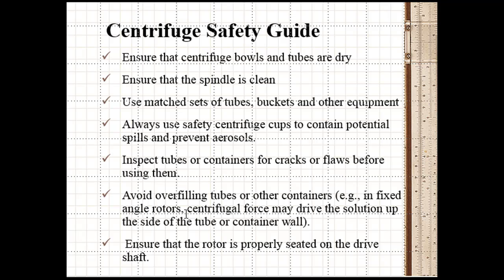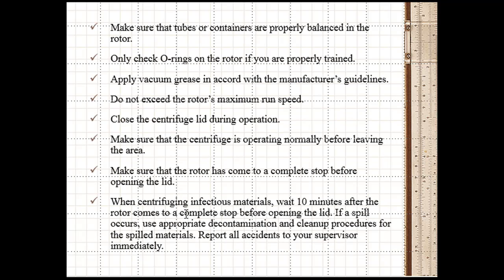For example, in a fixed angle rotor, centrifugal force may drive solution up the side of the tube and container wall. Ensure that the rotor is properly fitted on the drive shaft. Make sure tubes or containers are properly balanced in the rotor. Only check O-rings on a rotor if you are properly trained. Apply vacuum grease in accord with the manufacturer's guidelines. Do not exceed rotor maximum run speed. Close the centrifuge lid during operation. Make sure that the centrifuge is operating normally before leaving the area. Make sure that the rotor has come to a complete stop before opening the lid.